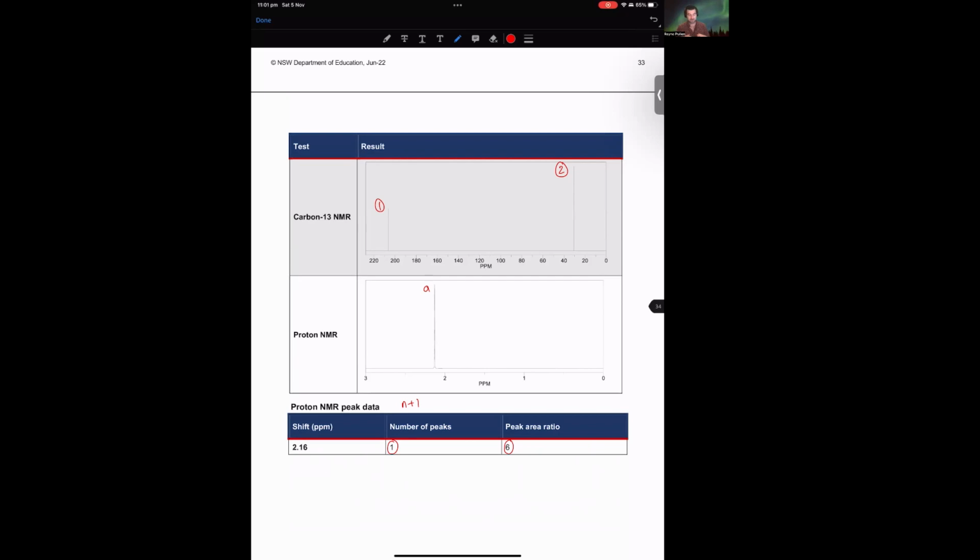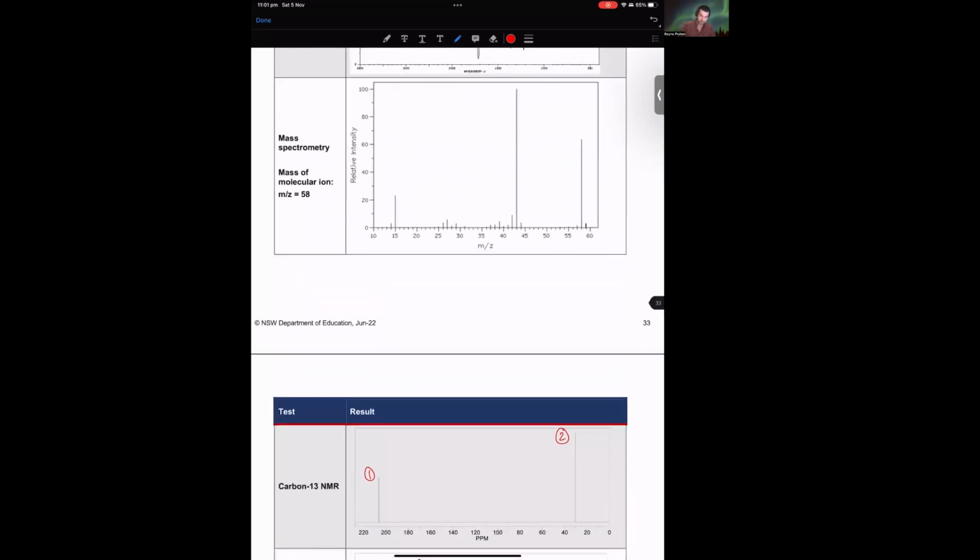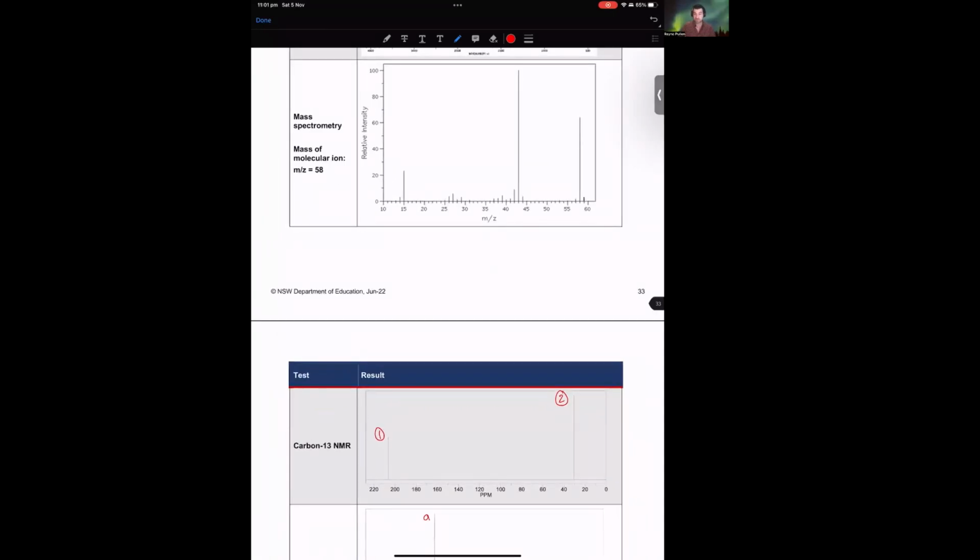So I've got a bit of an inkling of where this is going, but we'll come back up to the mass spec and the IR before we propose anything concrete. At this point, we're going to use the simplest ratio. Let's assume that this height difference is important, so there is 1 carbon for peak 1 and 2 carbons for peak 2.